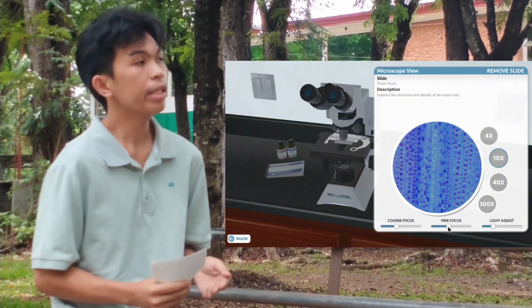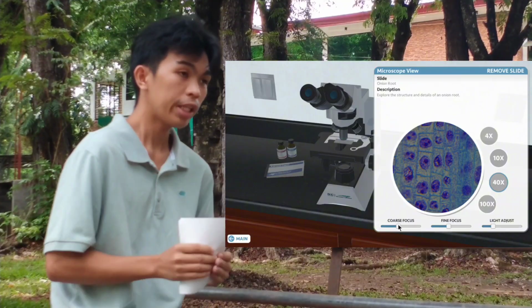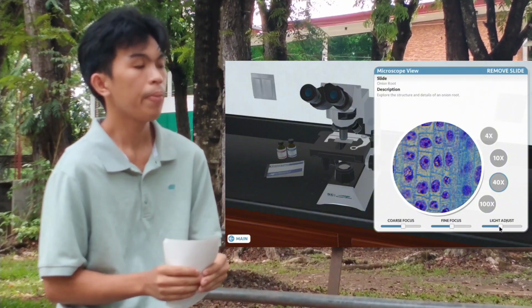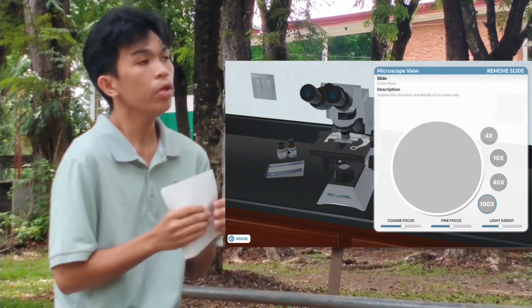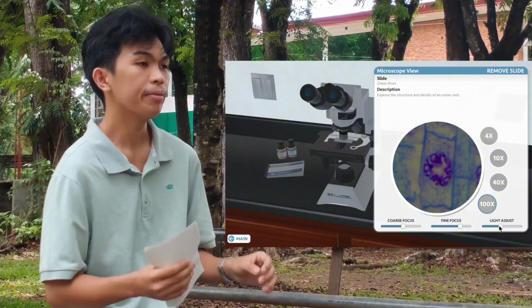You can manipulate it by switching the objective lenses from 4 times, 10 times, 40 times, and even 100 times. You can adjust the light and use the fine and coarse knobs to focus the image. It feels like you're operating a real one.